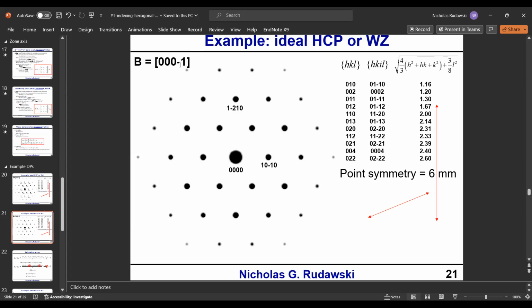We could talk about reassigning indices, but the really simple way is that all I have to do is swap a negative. Make this negative, and then make one of these two indices the opposite. If I switch this one to 1 bar 0 1 0, then I'm set.